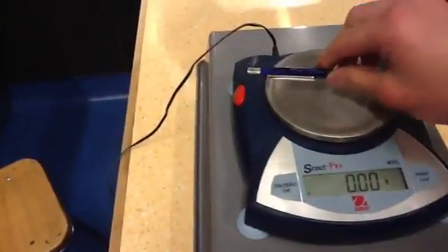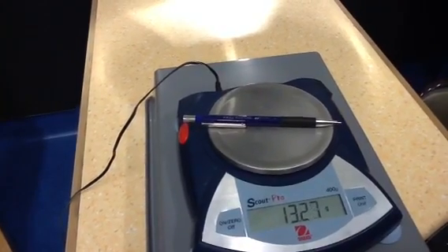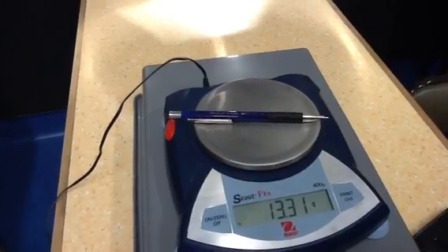Then you just put whatever you're measuring onto it and wait till it stops moving. It's 13.30 grams. 13.31 grams.